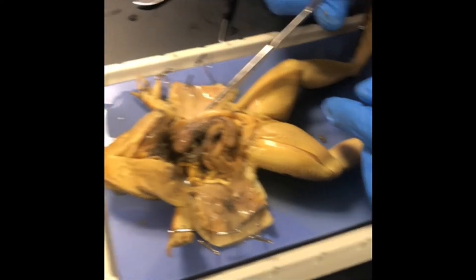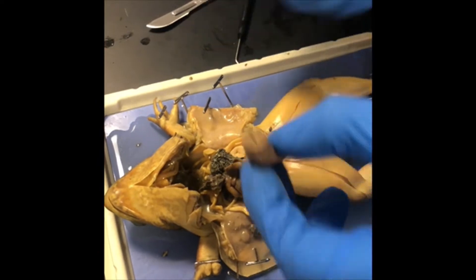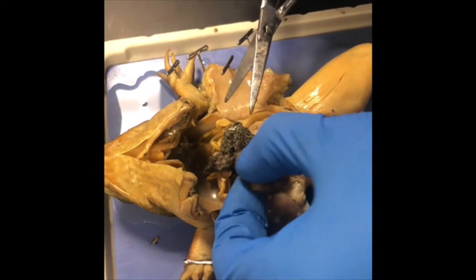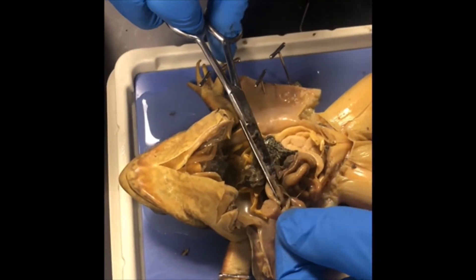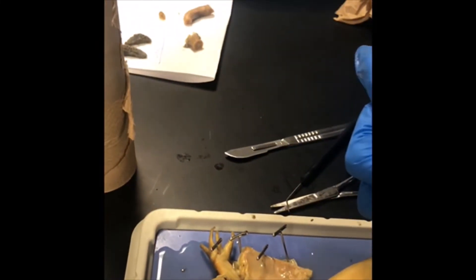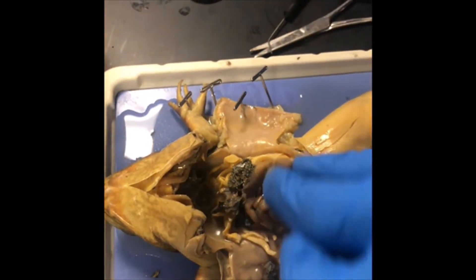Carefully use the scissors to remove the stomach and put it on your placemat. It's very difficult to distinguish the pancreas from the small intestine and the stomach. Carefully use your scissors to remove the pancreas and put it on your placemat. Underneath the stomach, right in there, is the pancreas — I got most of it off, so that will be good enough.